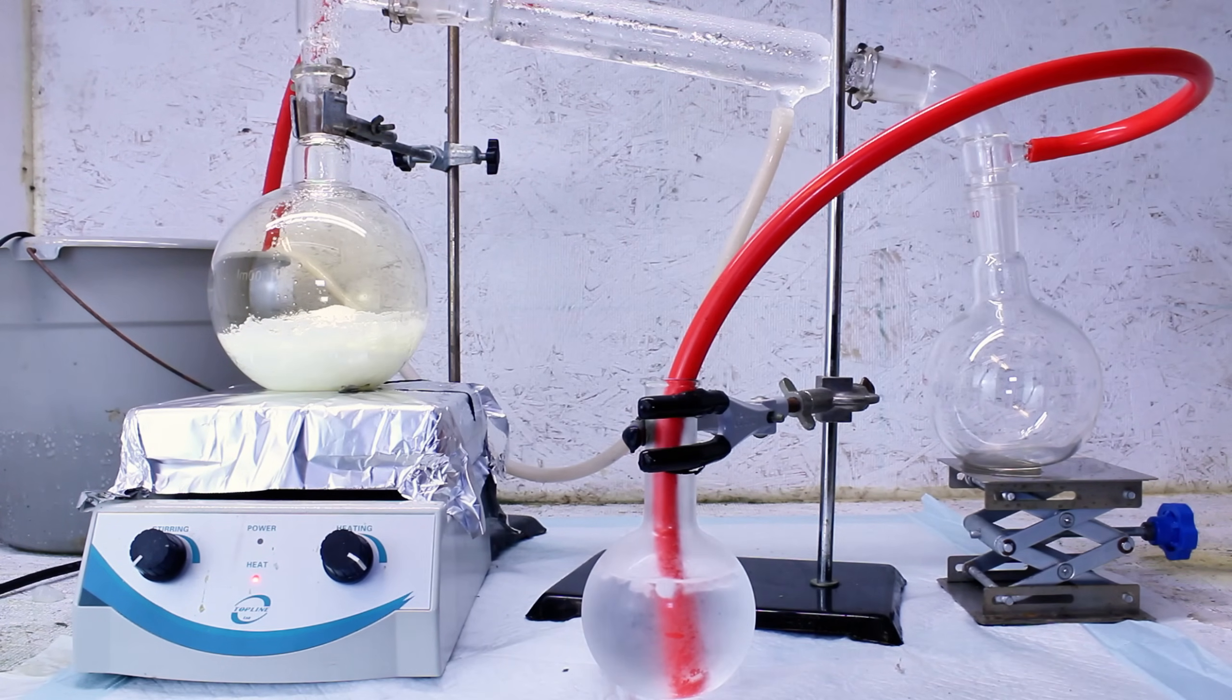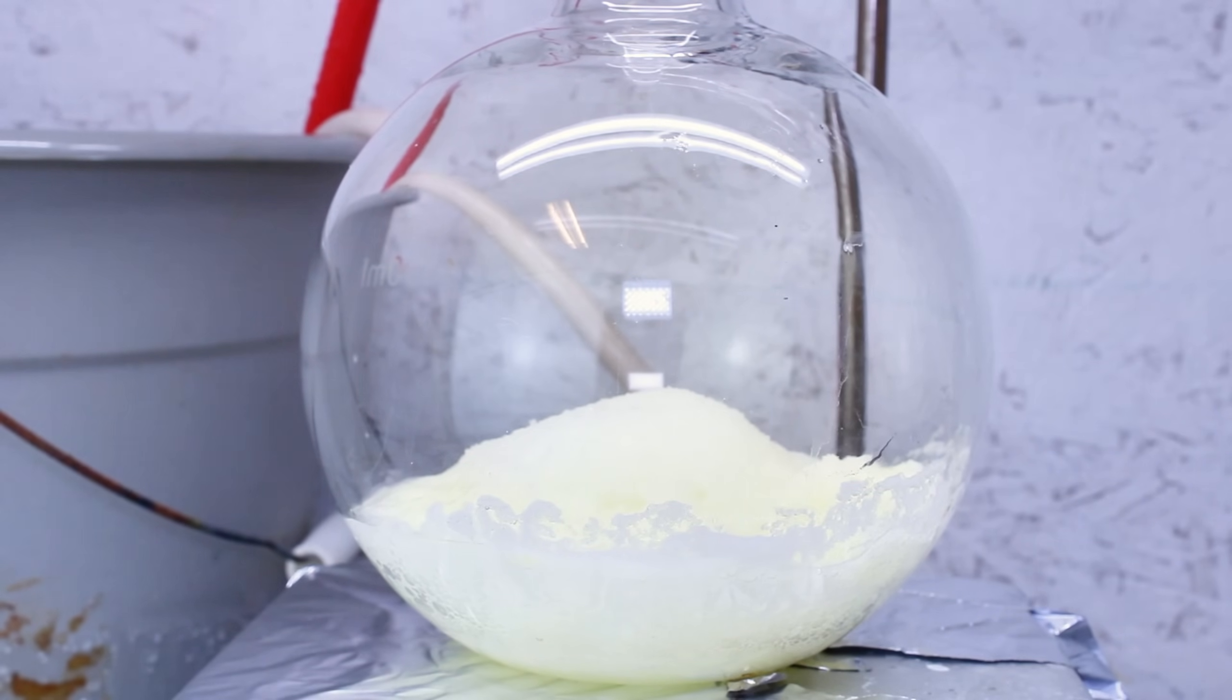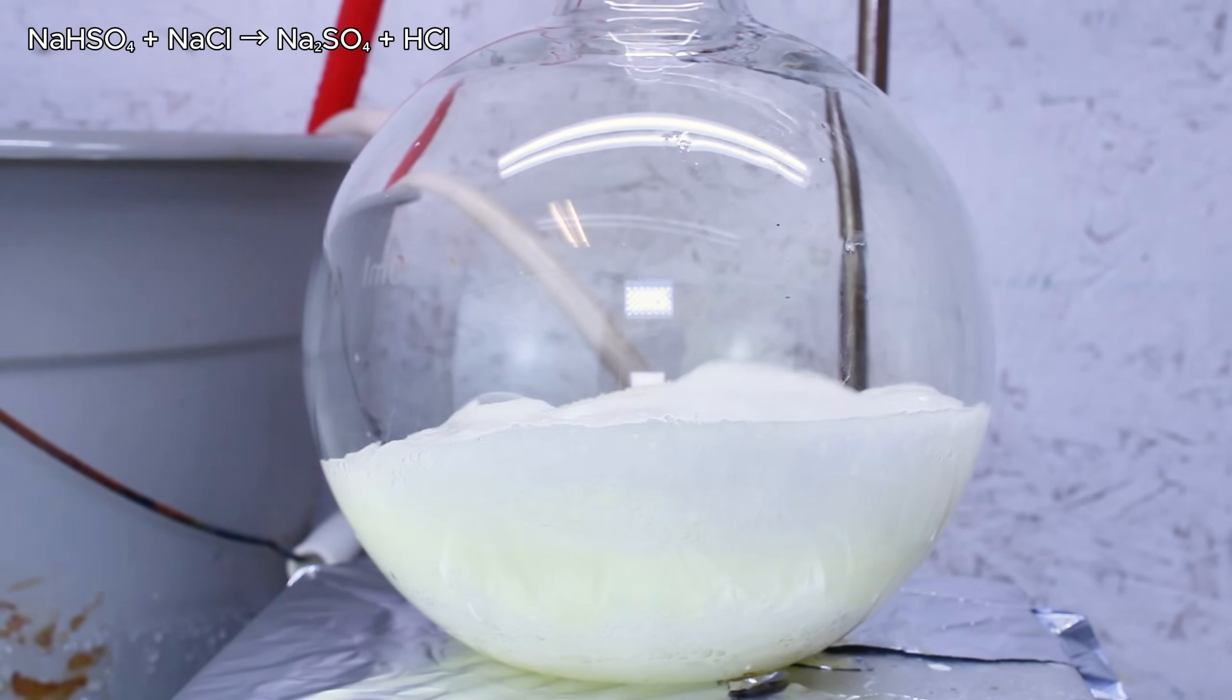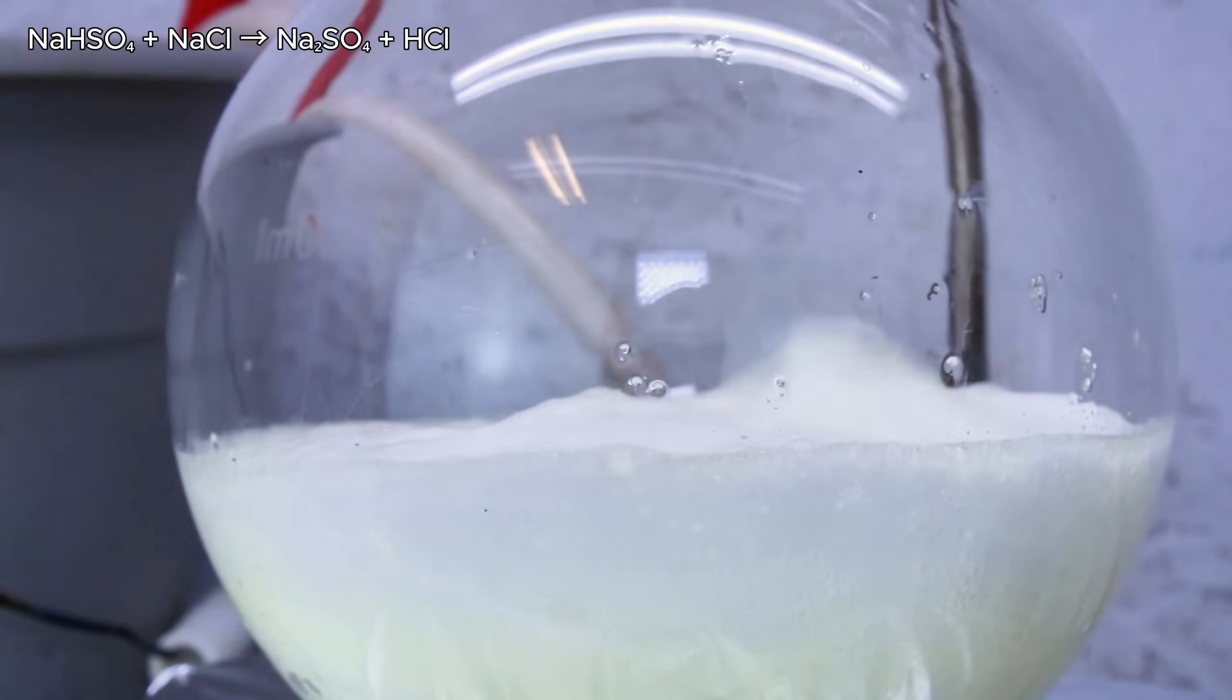With that said, making hydrochloric acid is essentially a process of first making hydrogen chloride gas, and then dissolving that gas in water. Now, I personally never really make hydrochloric acid, as it's very cheap to buy where I live. But when I do make it, I'll almost always do it by reacting sodium bisulfate with sodium chloride. And as it just so happens, I have a good bit of sodium bisulfate on hand. How convenient.